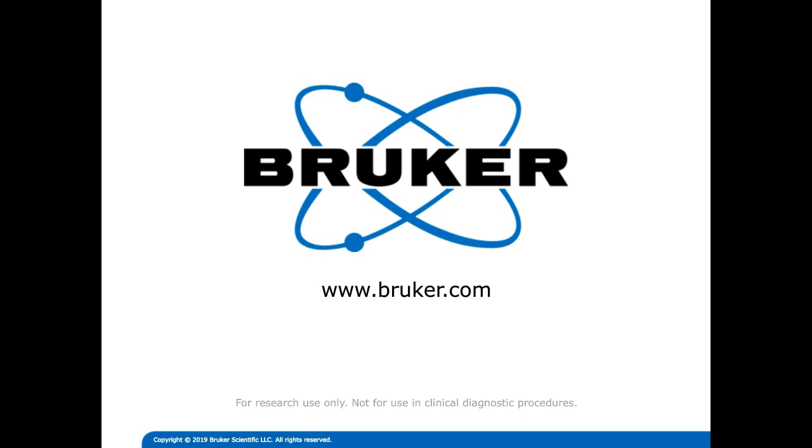Another question asks, I'm wondering if ESI data were acquired with HPLC separation. How about MALDI with HPLC? Yes, the ESI data was acquired using HPLC separation, and the MALDI data was not done in this instance with LC separation. It was just spotted directly on the plates. It is possible, if you have an LC that you can connect, to do spotting of the separated fractions as well.